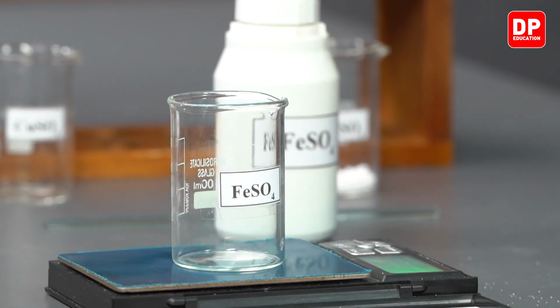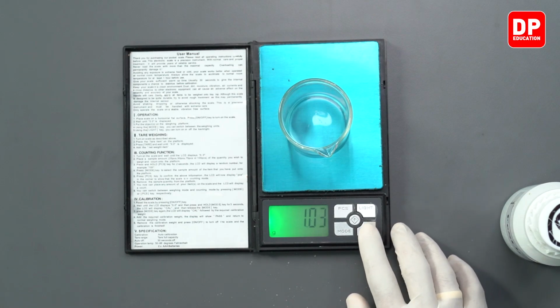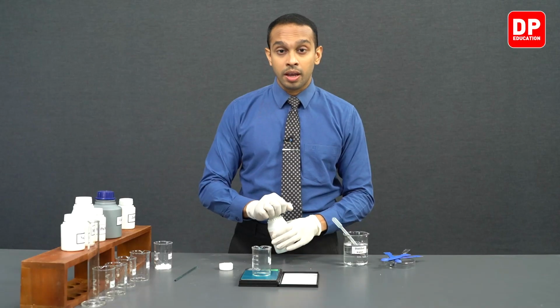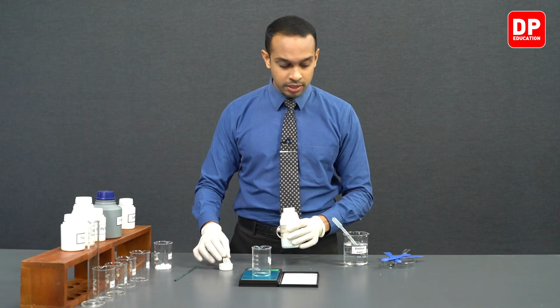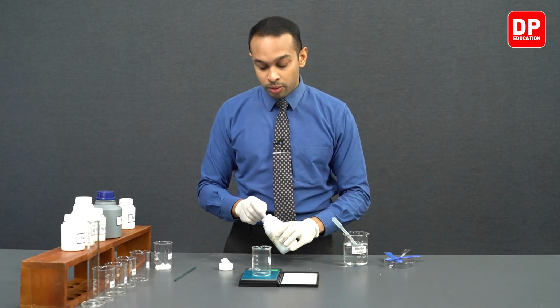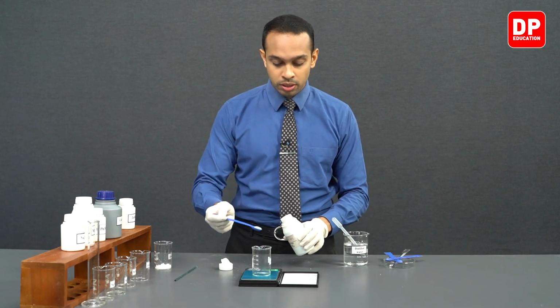So we will first of all place the beaker on our digital balance, and then we will tare the digital balance. Then we will take exactly 7.6 grams of ferrous sulfate. That is the mass of ferrous sulfate needed to prepare roughly 1 mole per decimeter cubed concentrated ferrous sulfate solution.